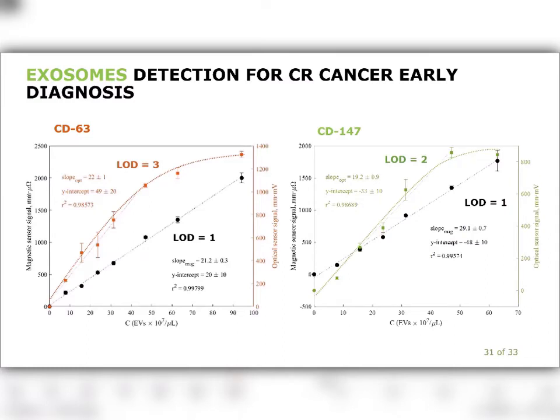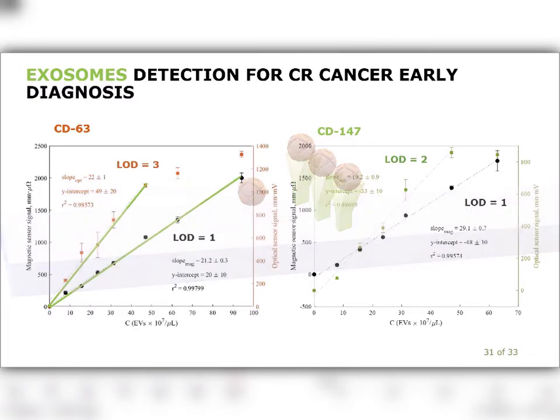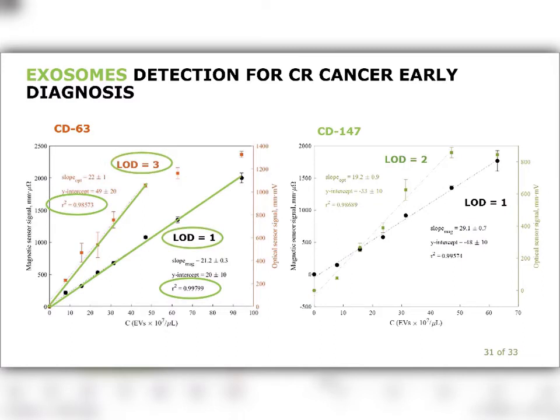First thing to look at is the linear range. For the magnetic sensor, this is all the measured range, while in the optical sensor, the range is shorter in both graphs. The reason is the saturation of the immunoassay. In the test line, there is, of course, a finite number of antibodies. When all the sites are occupied, the exosomes that get there must cross without attaching. Of course, the surface layer of the paper will saturate before the whole volume, and this is why the optical signal saturates before. The inductive sensor also has a better correlation factor and a smaller limit of detection in both graphs.